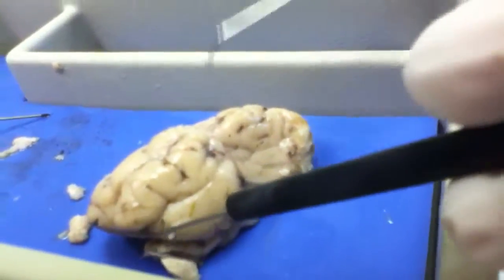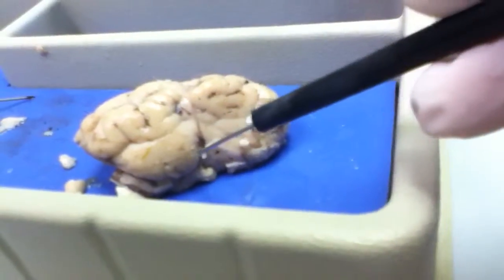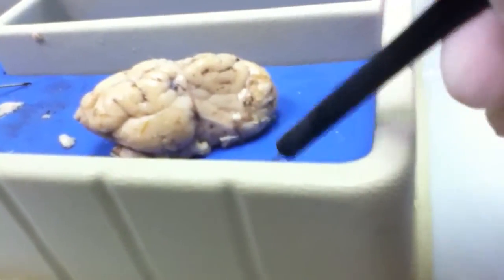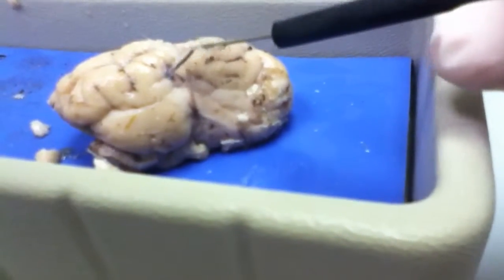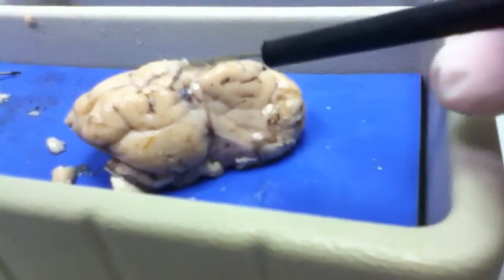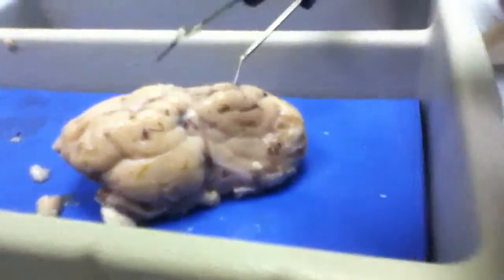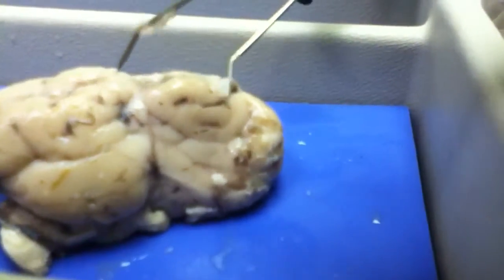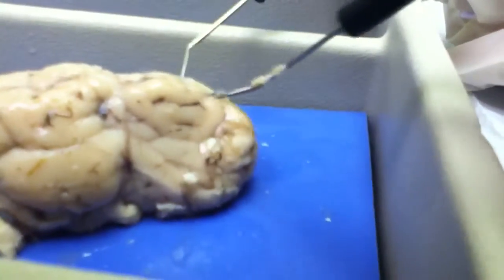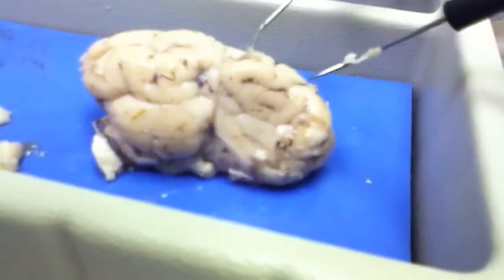That's like the occipital lobe right there — occipital's in the back. I just poked a hole in it. Of course, the gray and the white matter. The gray lacks the myelin that makes it white, so it's gray. The convolutions — basically the brain is a bunch of tubes squished together. It looks like worms, it's just tubes. If you stretch those all the way out, it'd be bigger than a beach ball.